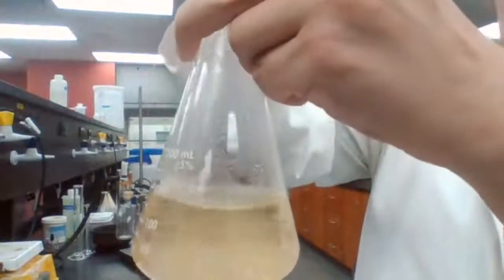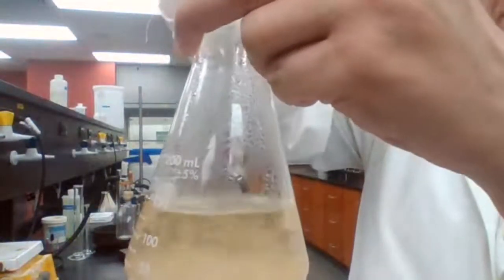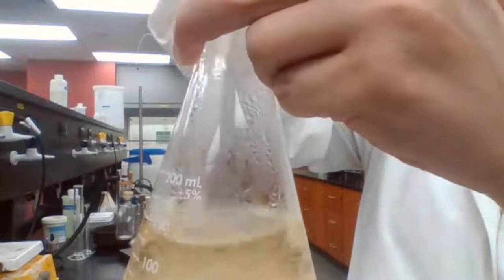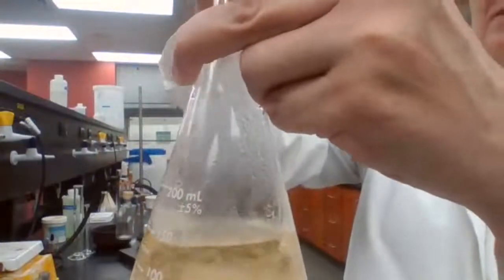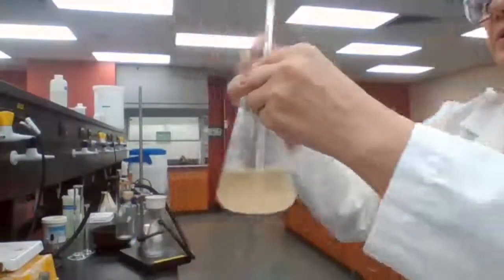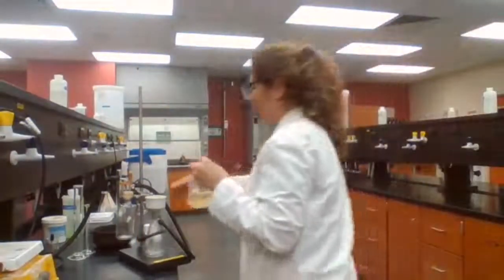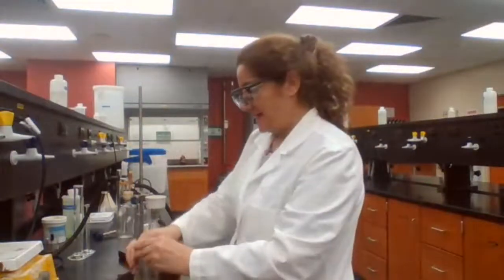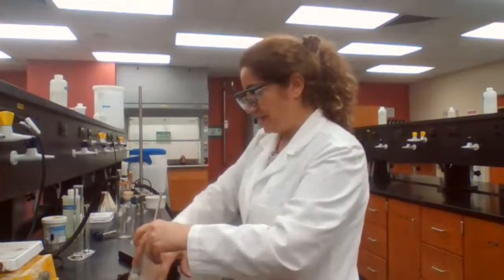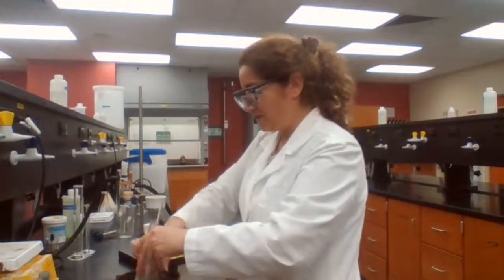Okay. I want to make sure that you see the particles or the crystals that are forming, and it's flaky, so it didn't all precipitate and settle down. Then we can place it now in the ice bath. So I place it in the ice bath. I have my own rule here for the timing for the ice bath.